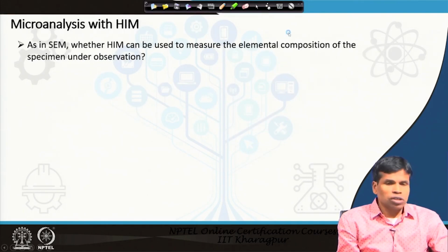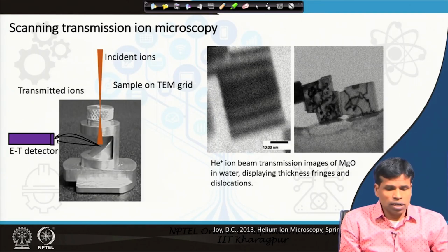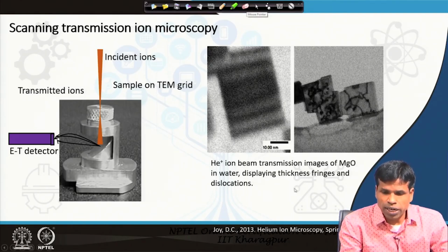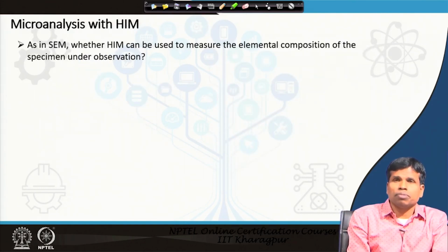So, this is about scanning transmission ion microscopy. As it is not as popular and not extensively used, I am not covering much detail on it. We will go next to another important topic, microanalysis with helium ion microscope.